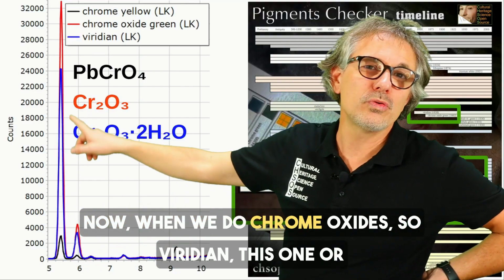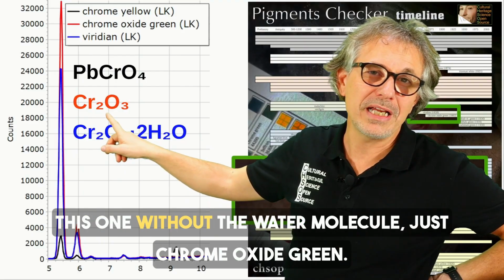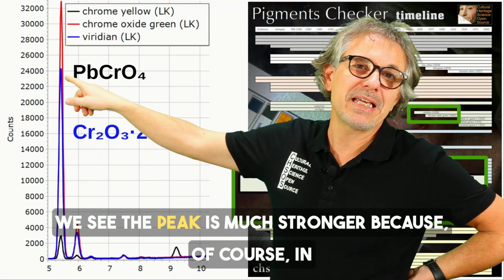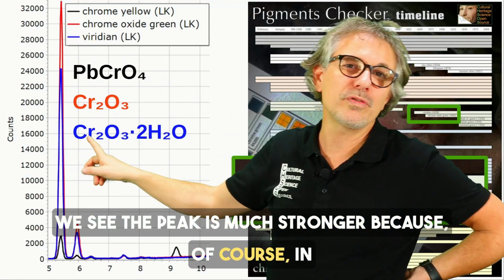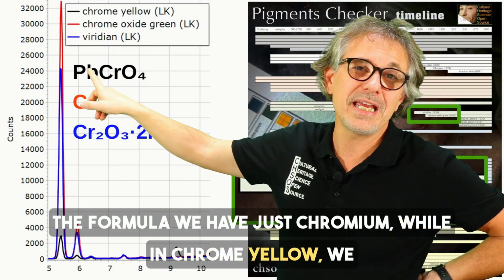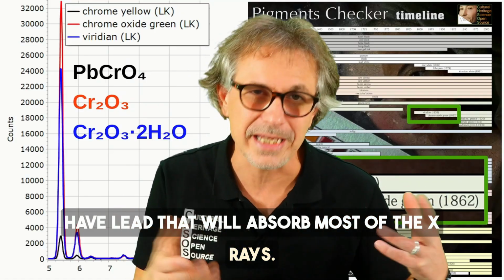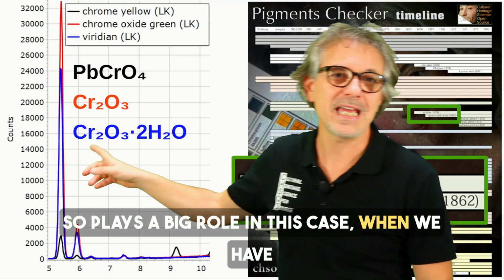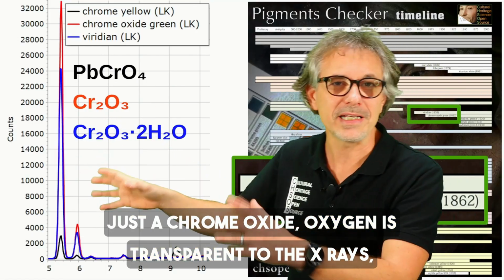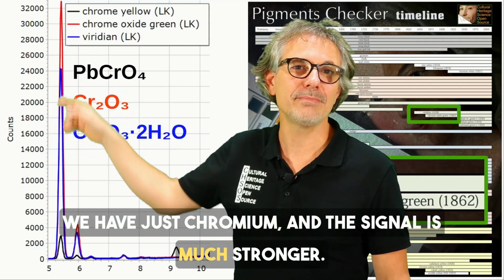Chrome yellow is the black one you see over here, about 2000 counts. Now when we do chrome oxides, so viridian, or this one without the water molecule, just chrome oxide green, we see the peak is much stronger, because of course in the formula we have just chromium, while in chrome yellow we have lead that will absorb most of the X-rays, so it plays a big role. In this case, when we have just a chrome oxide, oxygen is transparent to the X-rays, we have just chromium, and the signal is much stronger.